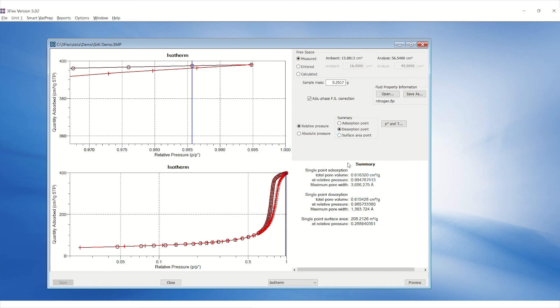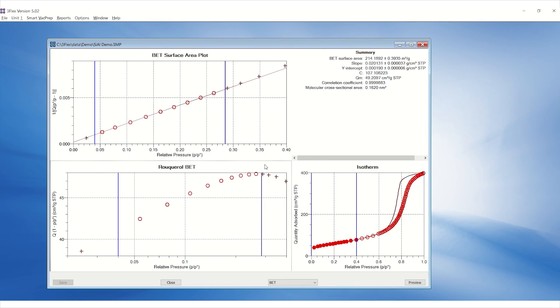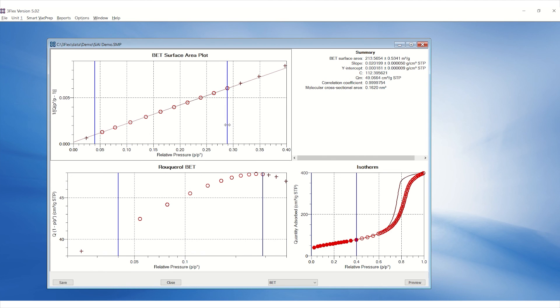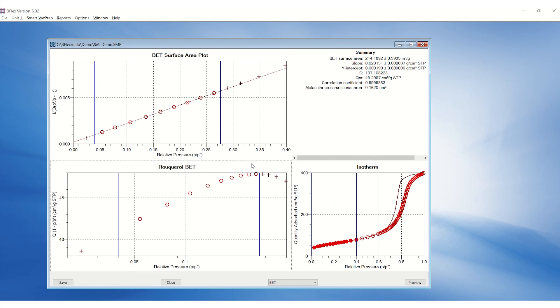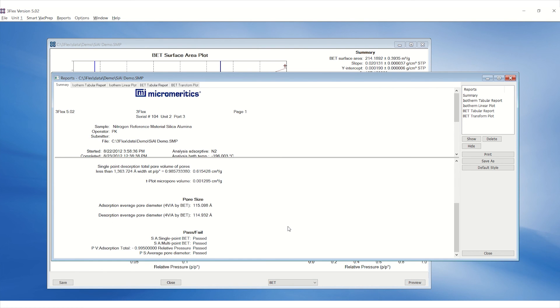Click on the drop-down menu below and select BET. Ensure the correct range of relative pressure is selected to calculate BET surface area. Click Preview to view the result.